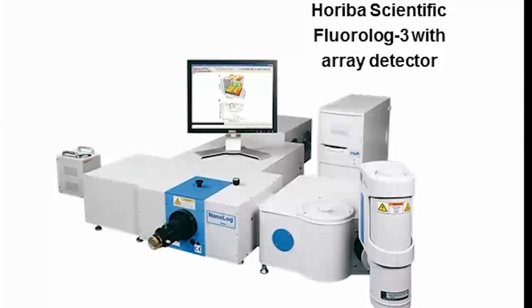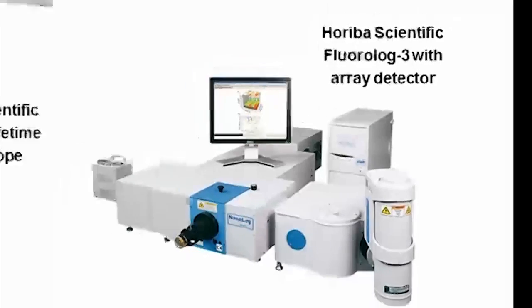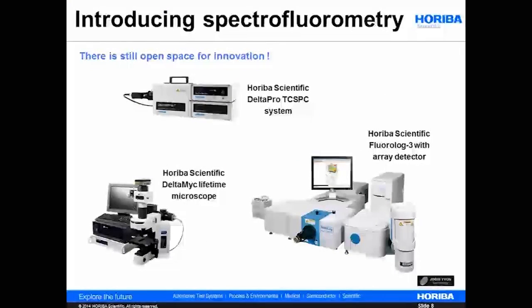So today, new trends arise. Fluorescence is not only a research topic, but becomes more and more a routine tool for various application fields. The instrumentation requirements evolve as well. The instrumentation needs to comply with all the quality control requirements: fast analysis, little sample preparation, simplified workflow and interface, easy interpretation of the results.